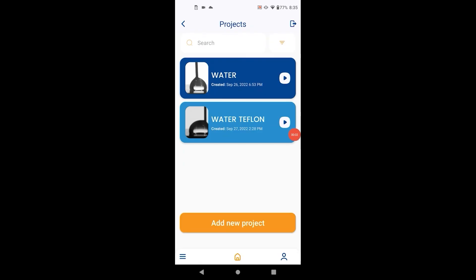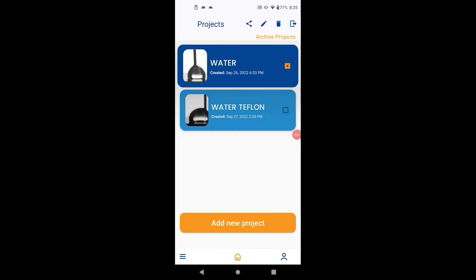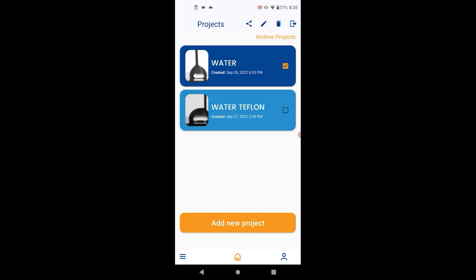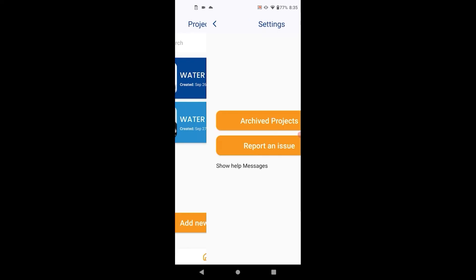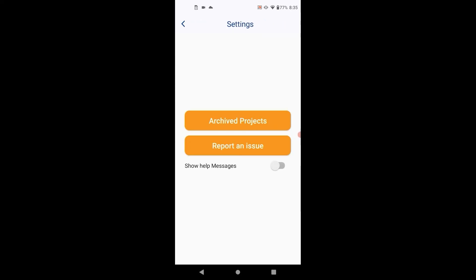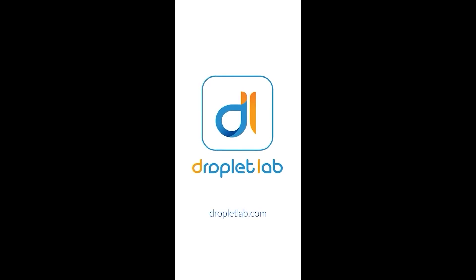To archive a project, long press the project and hit archive. Archived projects can be accessed from the settings screen. Visit our website to learn more.